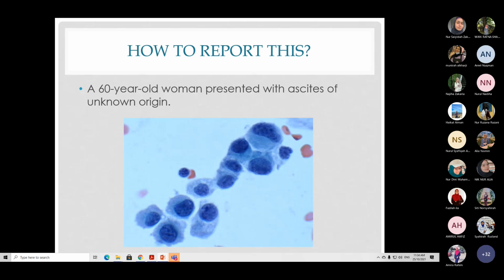Students, so far okay? Understand? I think it's more like morphology, right? You need to differentiate. But if you already know what normal mesothelial cells are, then I think, inshallah, you will grasp it. Then you know the differentiation between malignant and normal cells. Is it okay?